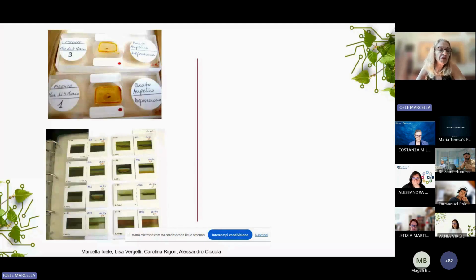So we now store in our archive almost 9,000 cross-sections. The first one is this one from the Deposizione by Beato Angelico, a sample taken in 1950 and archived a few years later. As you can see, the old cross-sections were documented by microscope, only with analogic documentation.